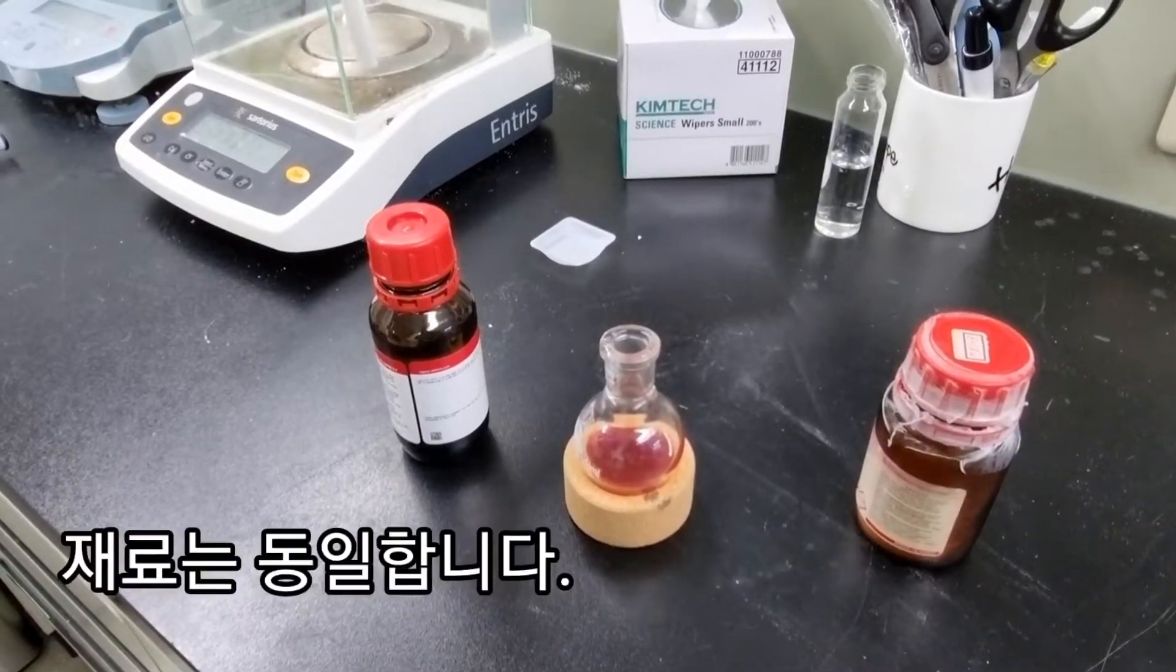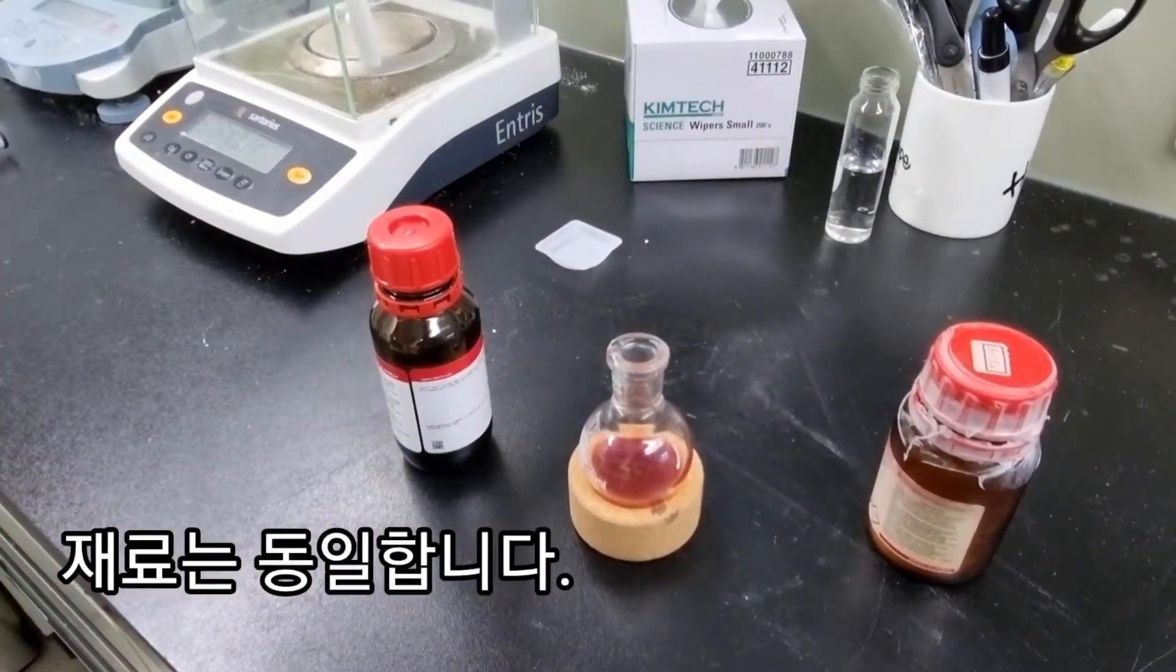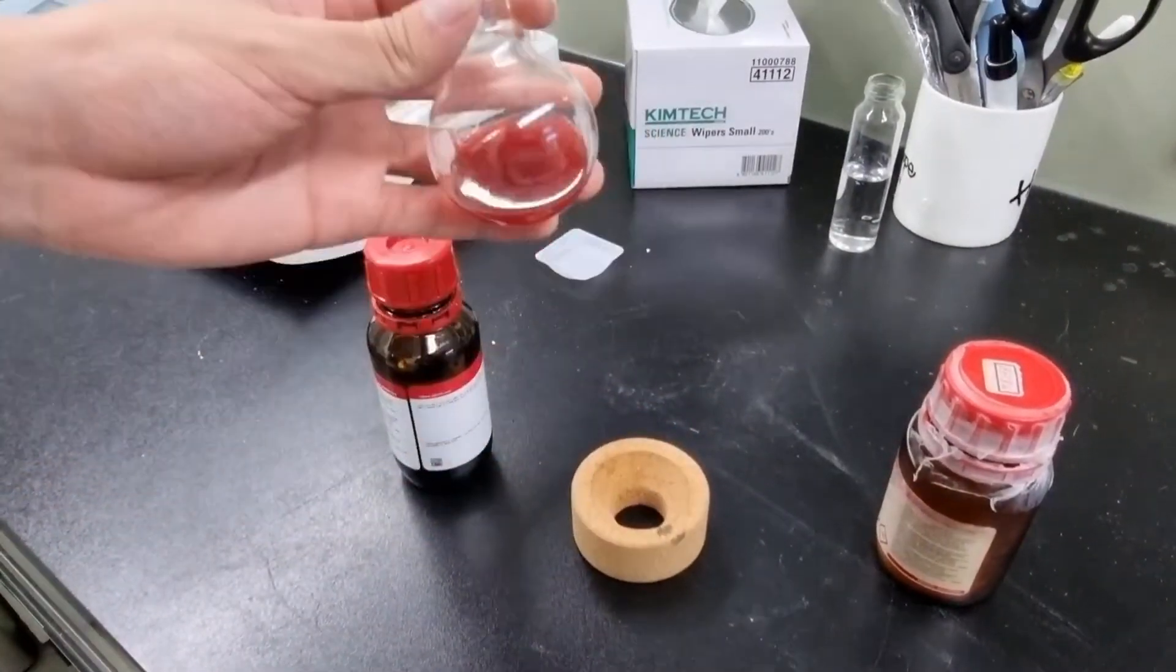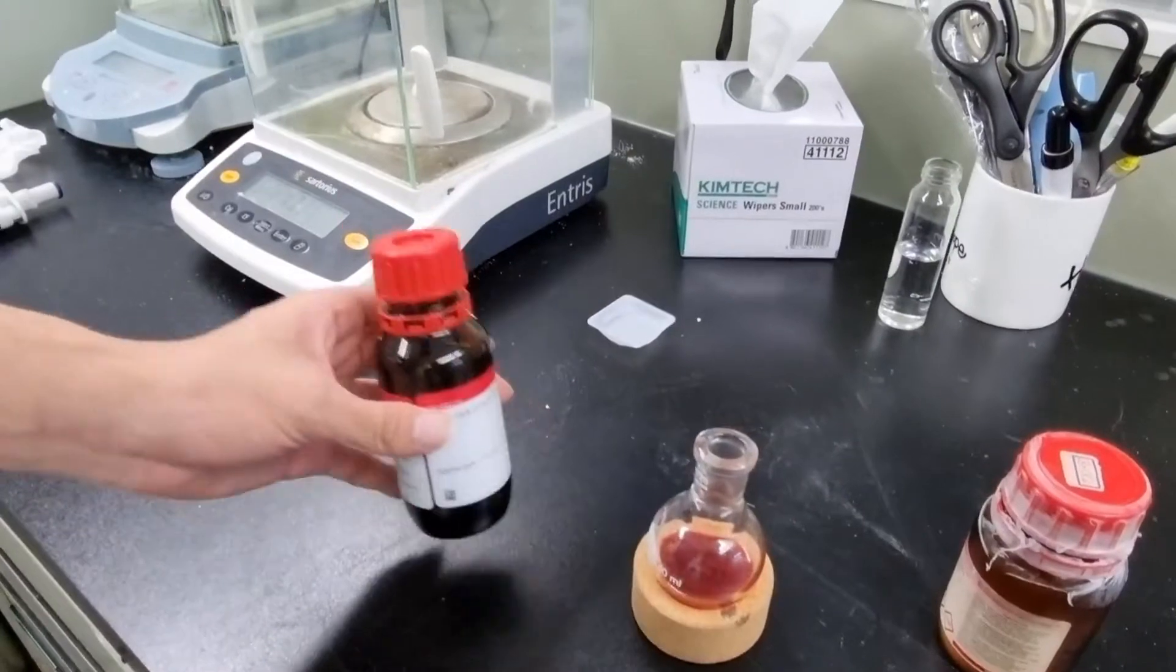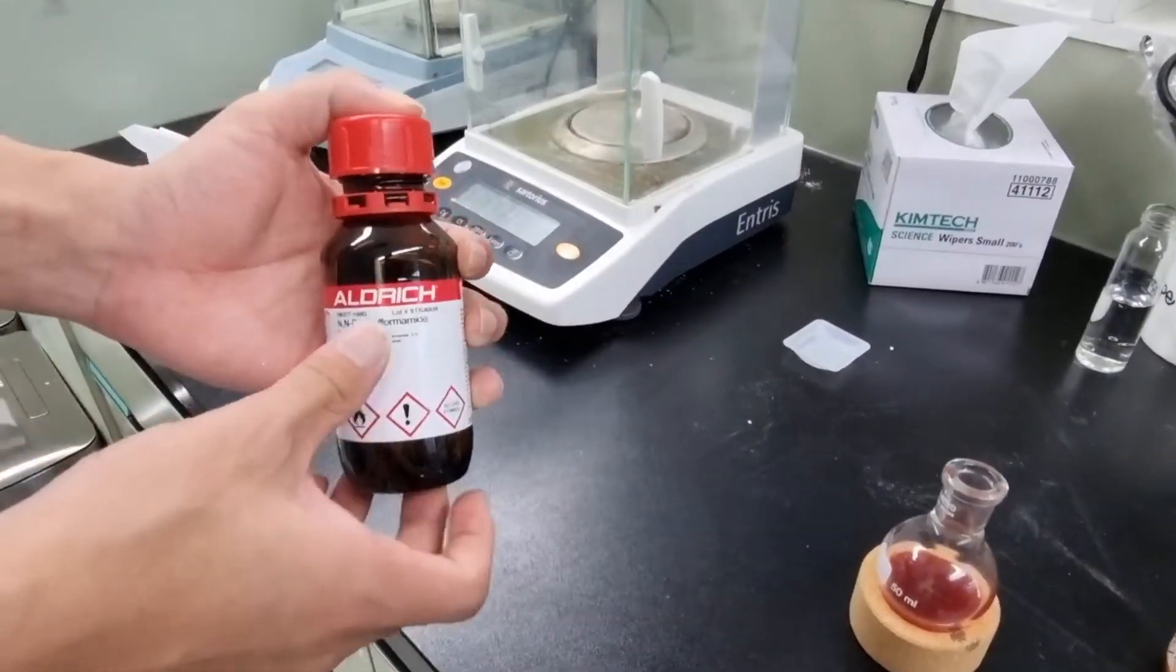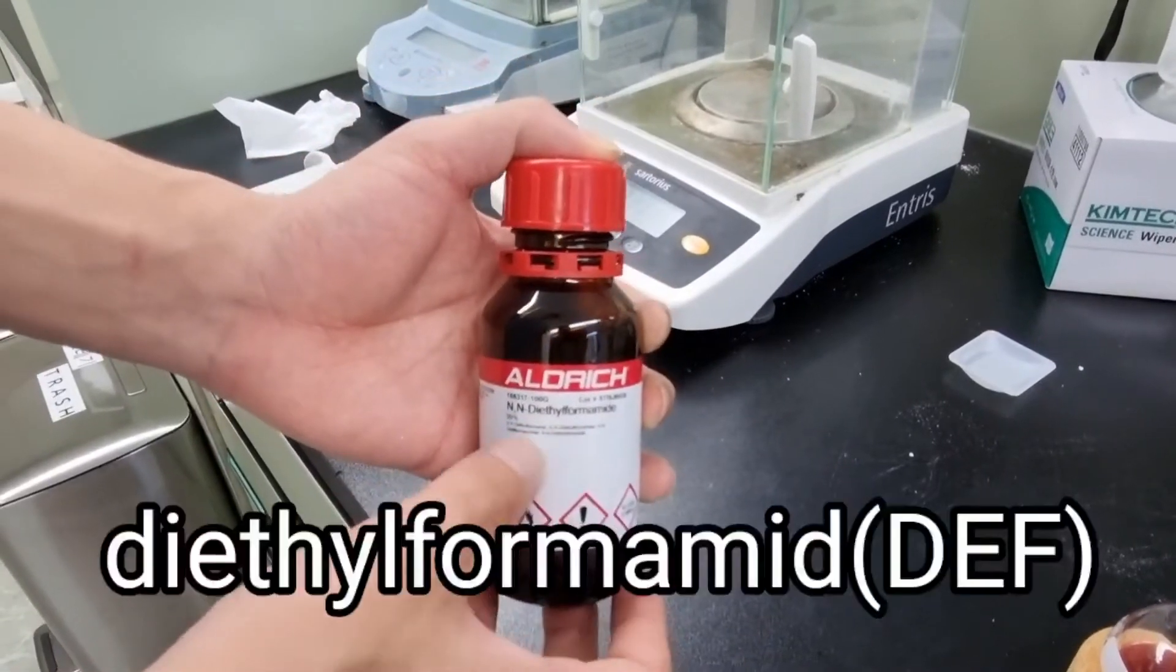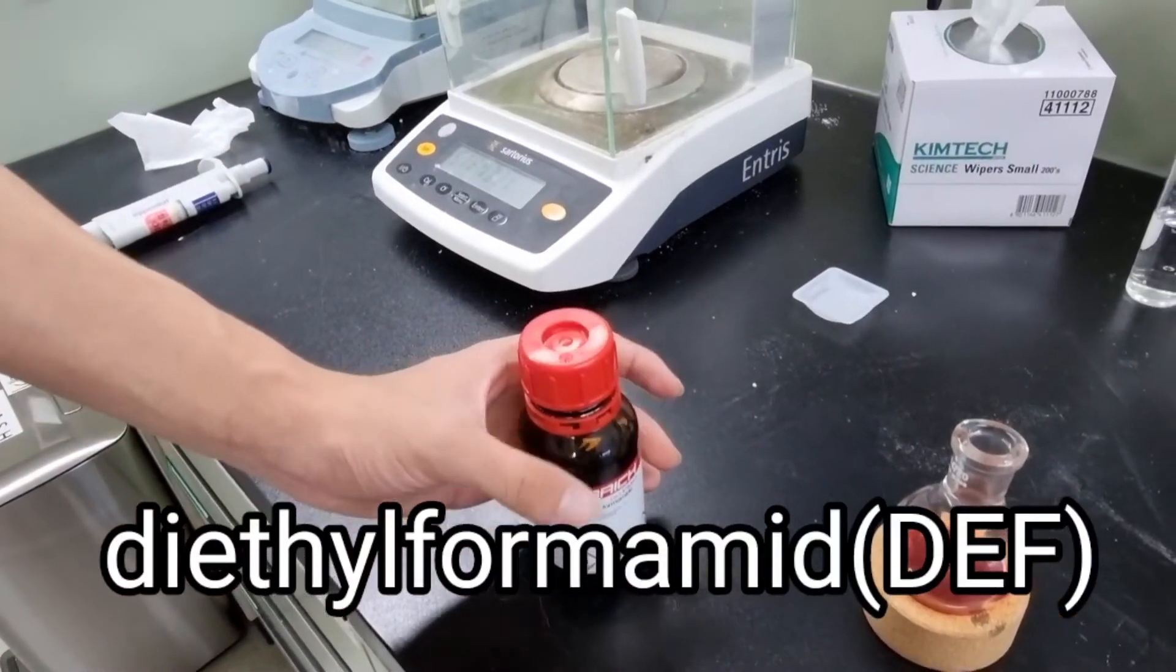So the ingredients are the same as before. You need a metal salt, in which I'll use zirconium chloride in this case, and this is the ligand solution. And this will be the solvent you will use. We usually use DMF, but in this case I use diethylformamide, which is called DEF.